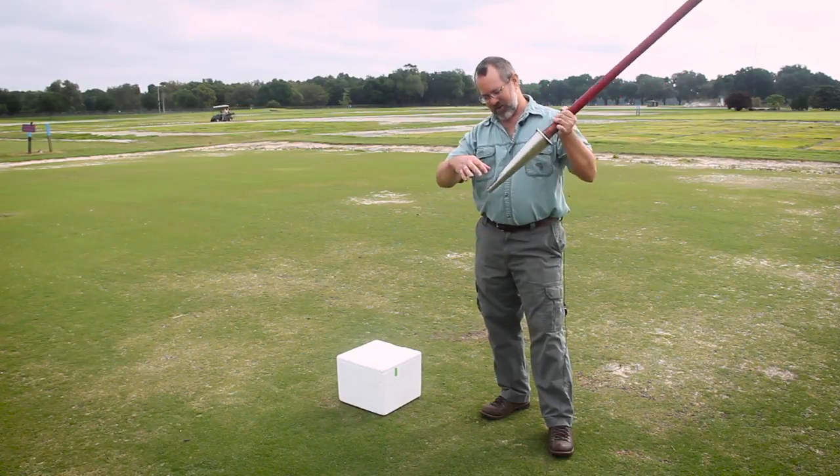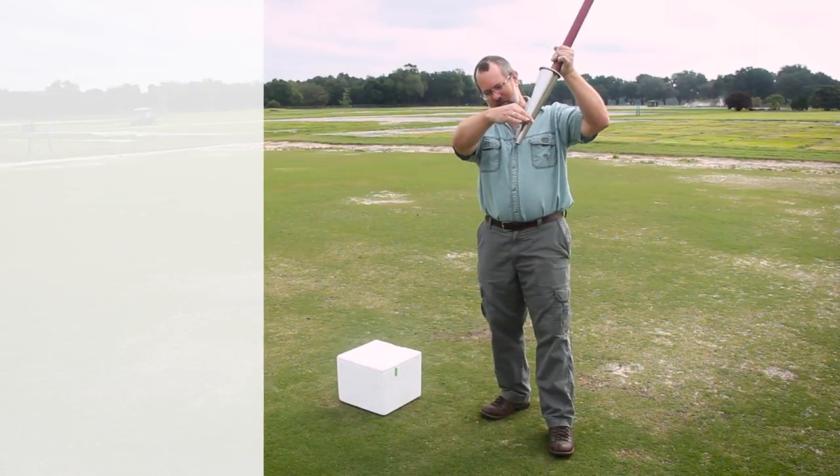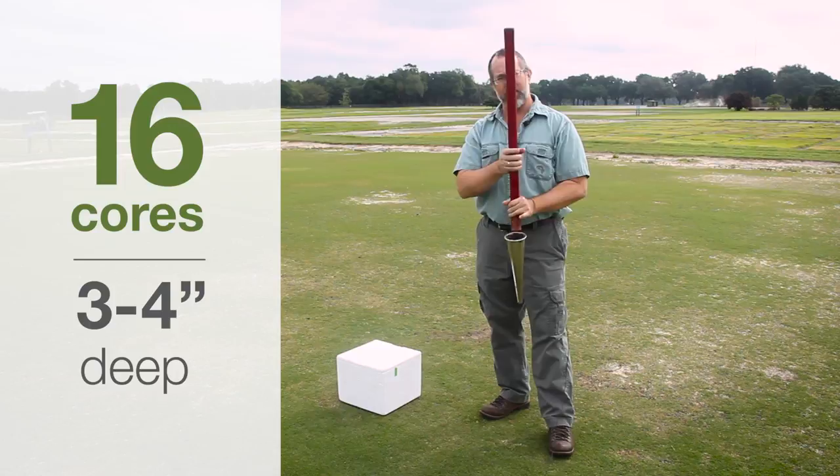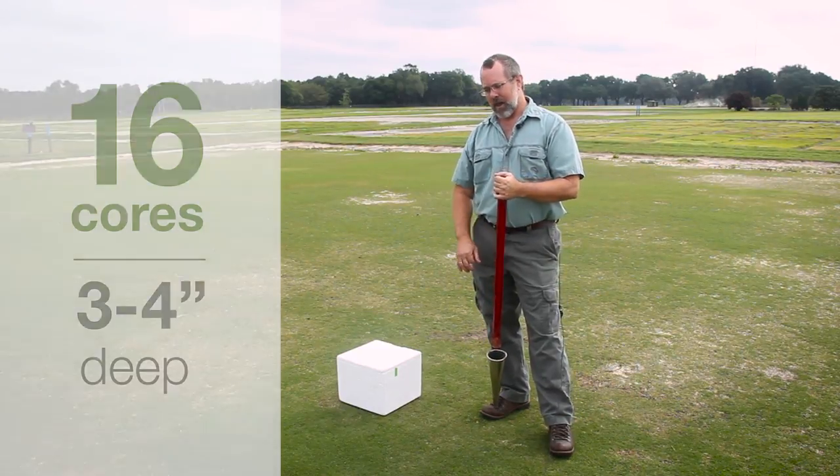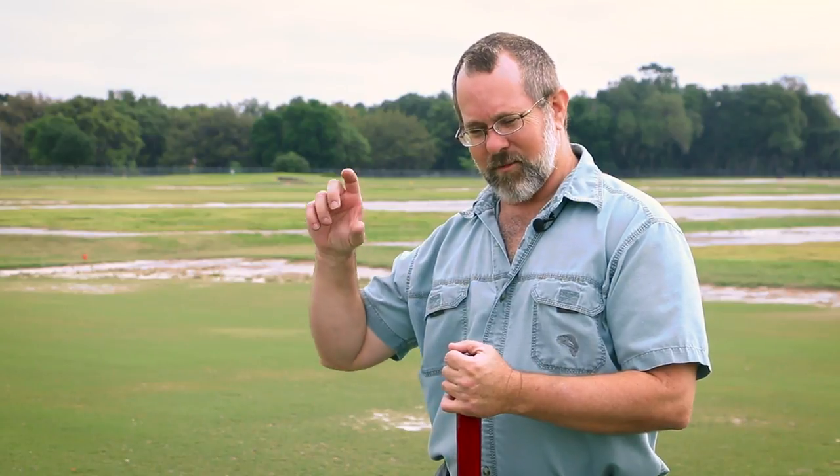Another important thing: you notice I took samples about this deep. Generally, three to four inches deep is where you want to go with a typical nematode sample. Sometimes on greens you may be closer to three inches, and on fairways and tees closer to four. But in that range, you're going to get where most of those nematodes are.